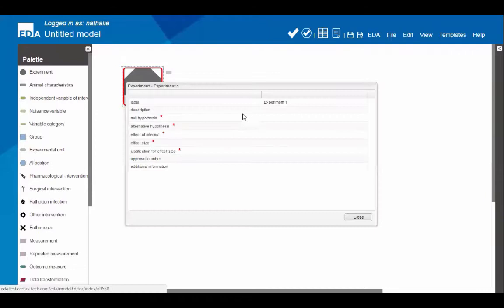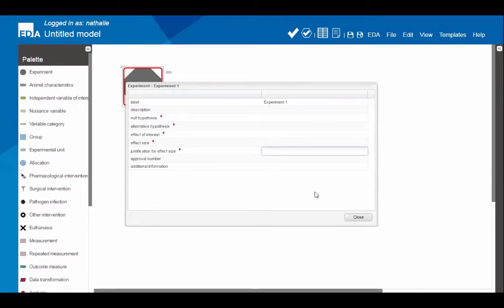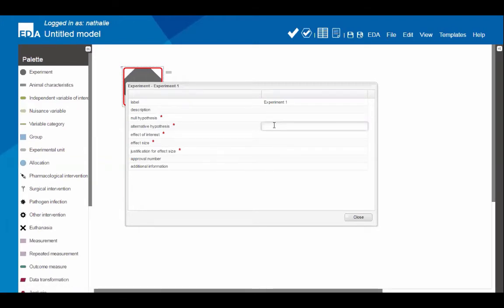I'm starting by dragging an experiment node onto the canvas. You can see the node has red boundaries because it's not connected to anything yet — anything disconnected will have red boundaries. The lines icon gives access to the node's properties. In the properties of the experiment node you can enter information about the hypothesis, the effect of interest, the effect size, and the justification for the effect size. The red stars indicate mandatory information — you'll get feedback from the EDA if this is missing, though it won't prevent you from using the system. If you don't know something at this stage, leave it blank and wait for the feedback.